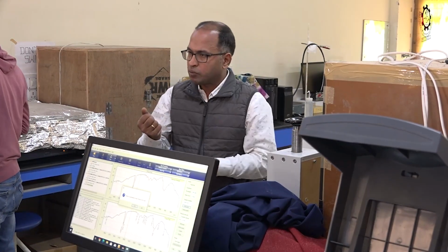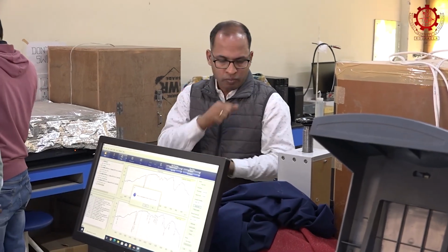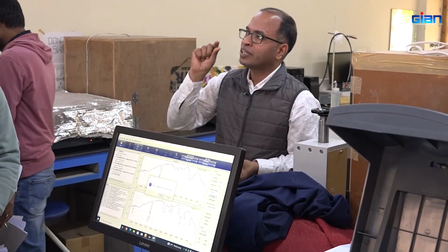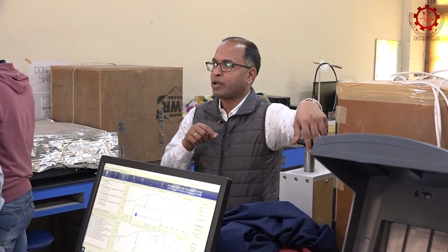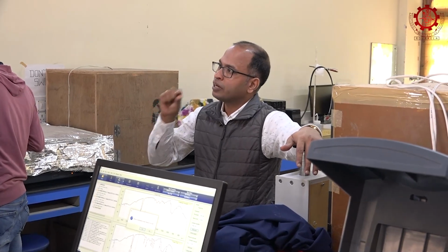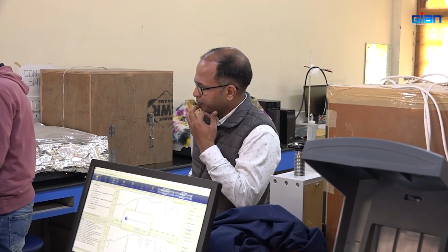So you take a mortar and pestle, grind it properly, try to make it uniform, and then convert that solid into a thin film, and that is what it is here. We can apply pressure. When we apply pressure, that solid mixture will turn into a thin film, okay, and that we can use.